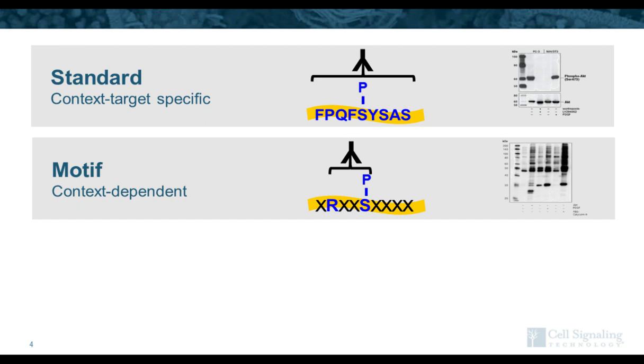Well, the antibodies we use for PTM Scan are a little bit different. So instead of using a single peptide as our antigen, we're actually using degenerate peptide libraries. So again, here we have a phosphopeptide, we have a phosphoserine in the middle, and an arginine at -3. And those two residues are fixed and present in every peptide in the library. And then we vary all the amino acids around it. We raise antibodies against that library of peptides. And now what we end up with are antibodies that are really exquisitely specific for that targeted motif, in this case RXX phospho-S, but broadly reactive against a lot of different primary amino acid sequences.